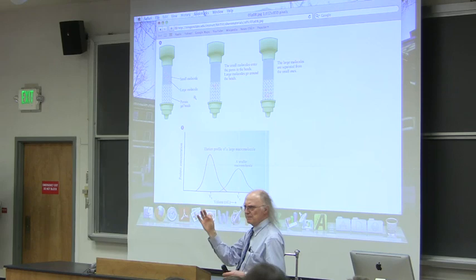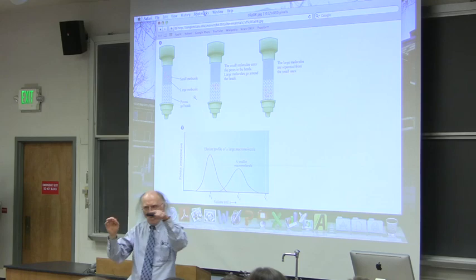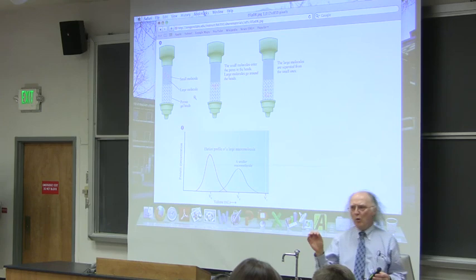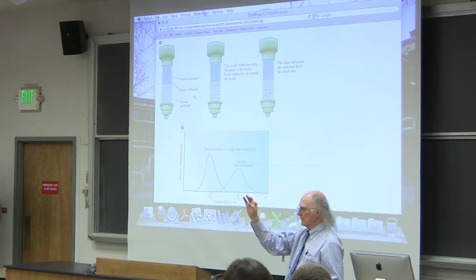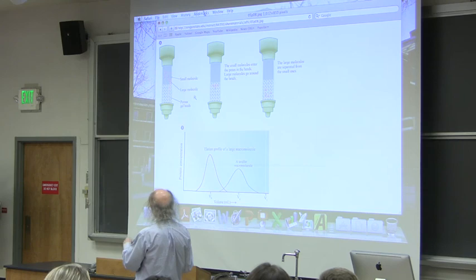What's so special about these beads? What's special about these beads is that these little beads have tunnels in them. That is, they're not just a solid bead, but there's little holes bored through them. The little holes that are bored through them all have the same diameter. So we can imagine a little tunnel, all of which is identical in width. Now, any given bead is going to have many of these, and we have many, many of the beads. So we have zillions of tunnels there.